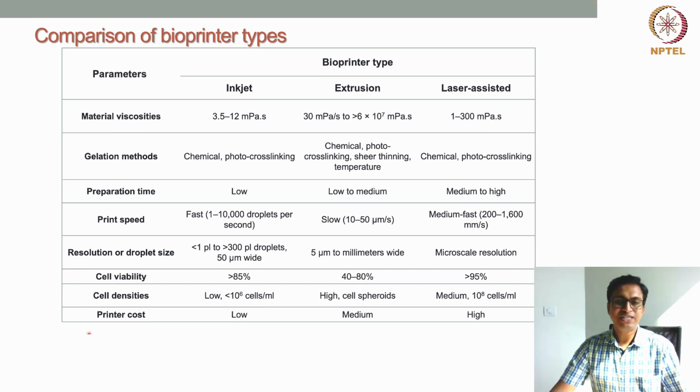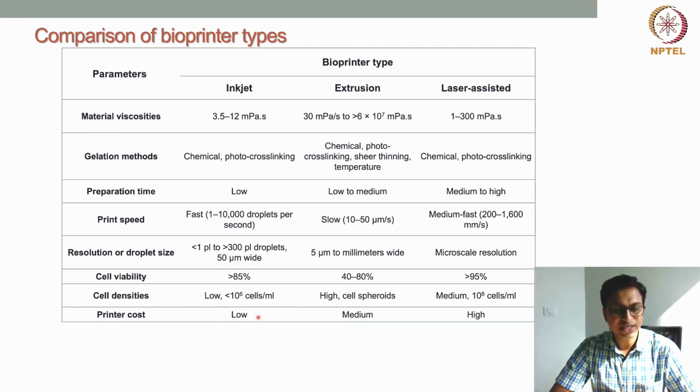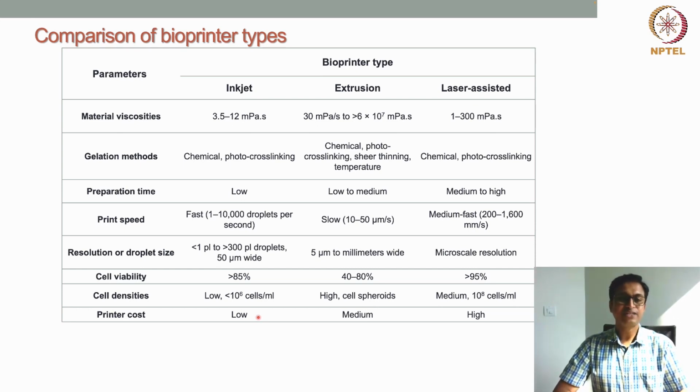Now coming to the printer cost. In inkjet bioprinting, the cost of the printer is very low. As I have already discussed, common office printers are used or modified to print cells. So the cost of the printer is not very high in case of inkjet based bioprinting.